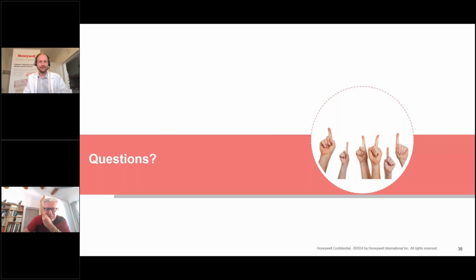I received some questions, and I will start. The first question is from Germany. What are the differences between normal reagents and special oven reagents?